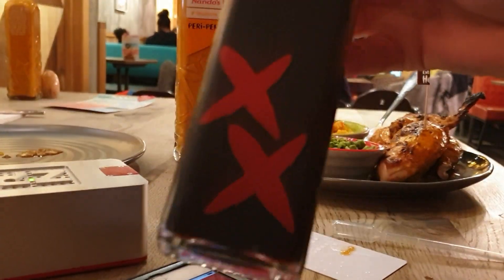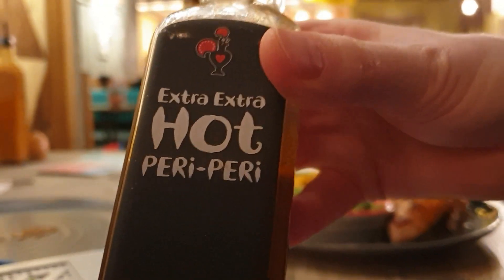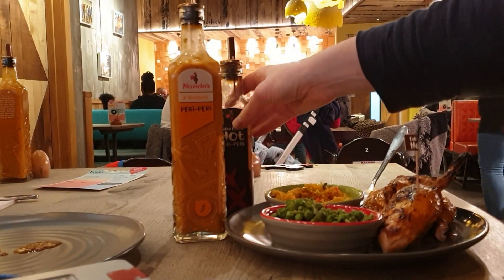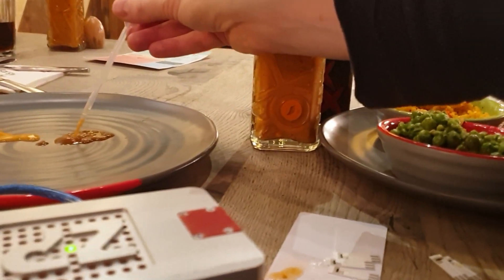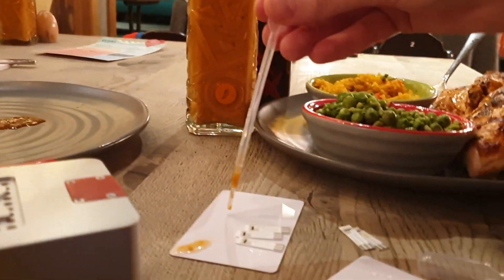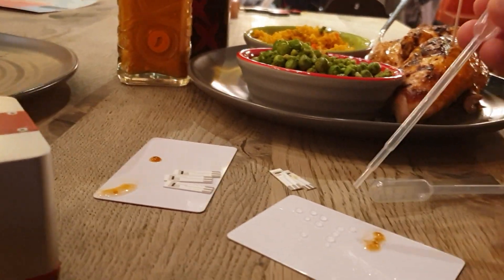I'm going to take some of the Nando's hot sauce. It's actually better to do a one-in-ten dilution, so I'll take a little drop of it — which I've done there — and now I'm going to dilute it.